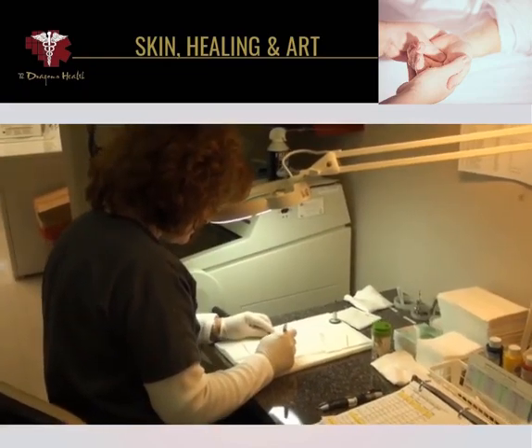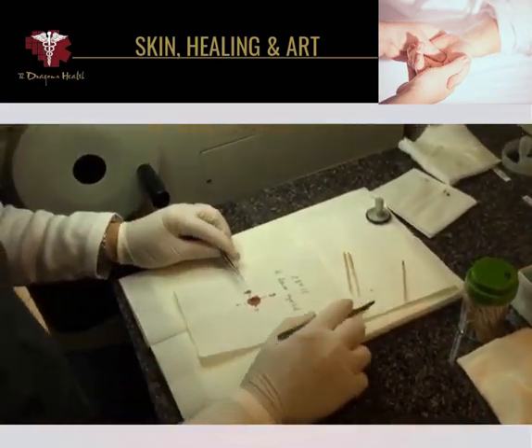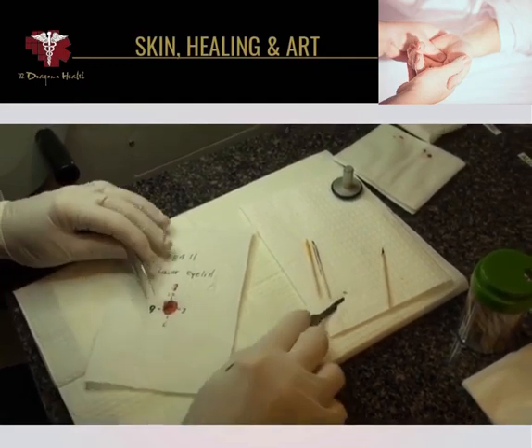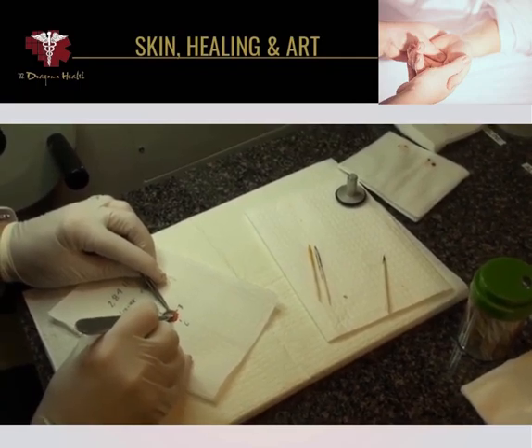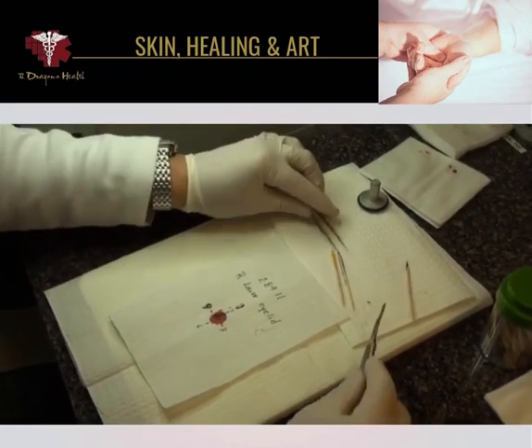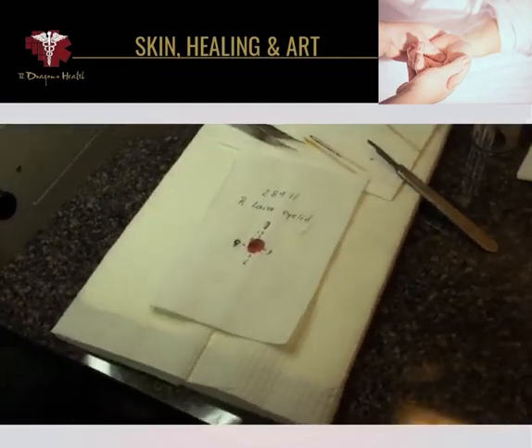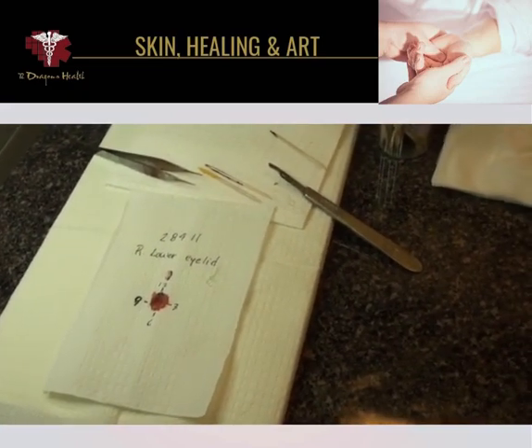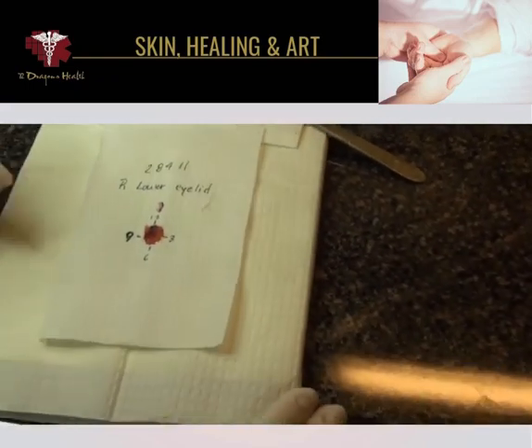Now we're in the Mohs Histotec lab, and the specimen that you just saw being removed is being further worked with so that the edges are flattened. The goal is to get the tissue around the edges in the same plane as the deep margin, so when this little disc of tissue is put into the cryostat to be cut, the specimen will be mounted on a so-called chuck.